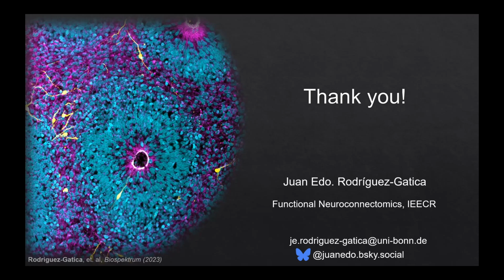The difference is not that much. So you can go there before and after, and see the sphericity of the nucleus and the size, and then you can get the expansion factor. That will depend more on the type of samples that you're working on. But if you want, you can also send me a mail, and we can talk about that.